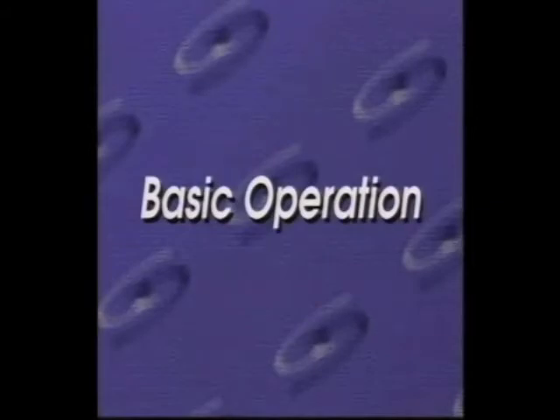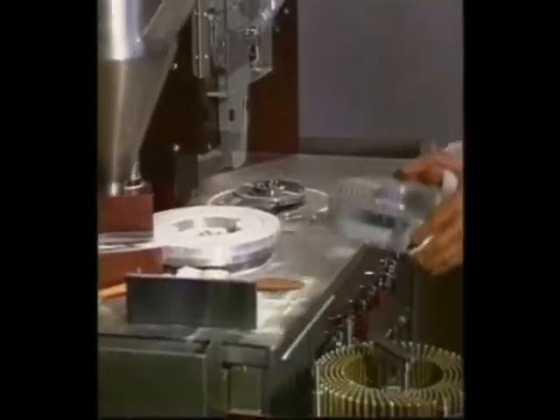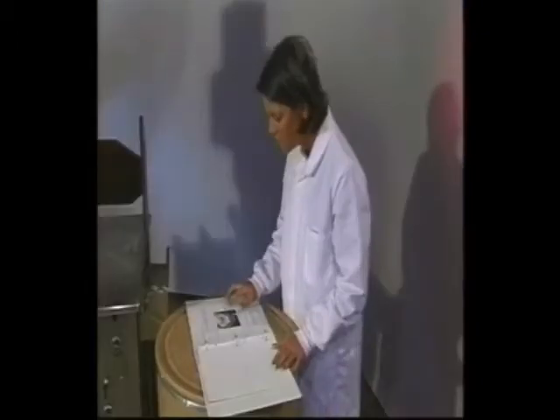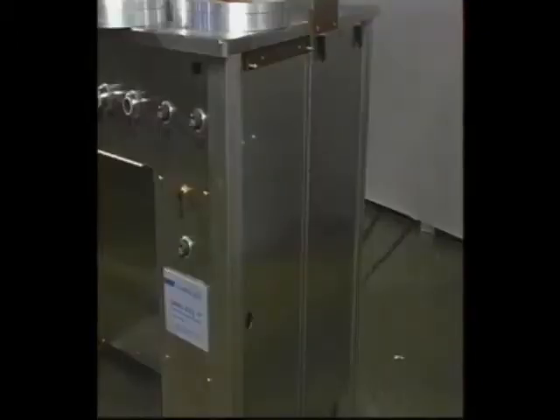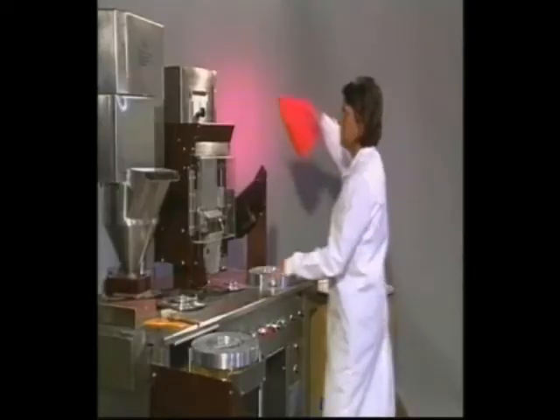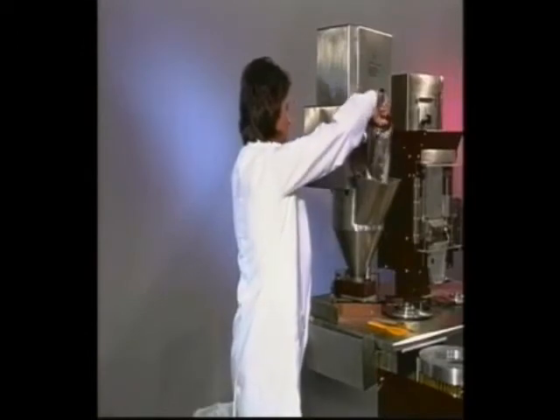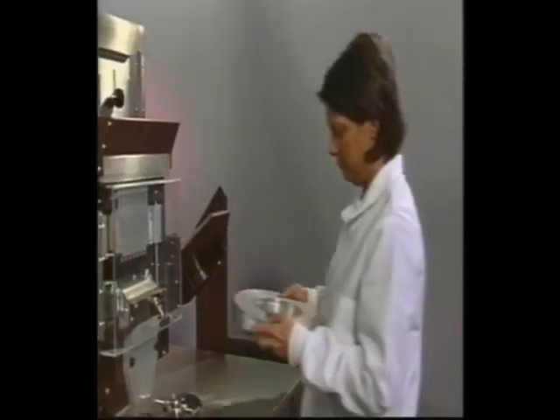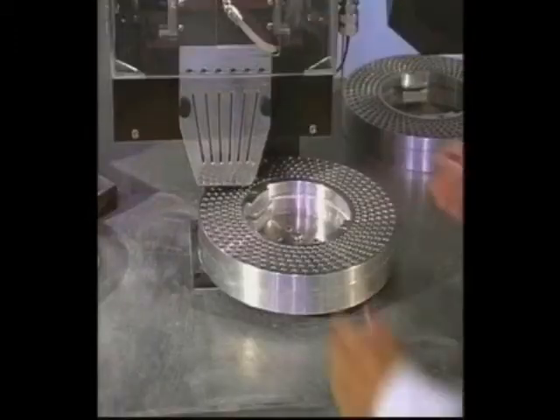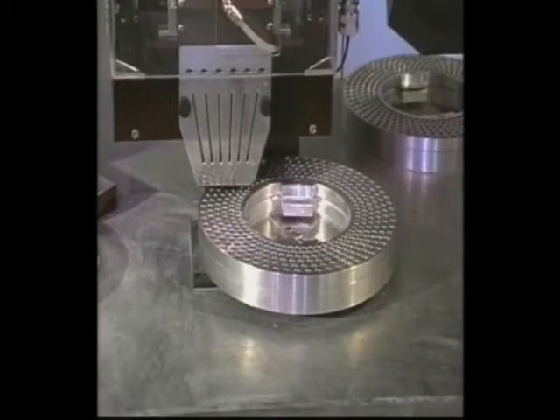Now you are ready to run through the basic operation of the Model 10. You will find that operating it is similar to keeping a rhythm or a beat. Remember, all of this information can be found in the operations manual provided with your machine. The first step is to turn the main power switch on. Next, fill your capsule hopper with the correct size capsules and fill your powder hopper with the specified product. Take your filling ring, top and bottom together, and put them on the rectifier table. To ensure the ring is seated properly, gently turn it clockwise until it hits the guide pins on the rectifier table.